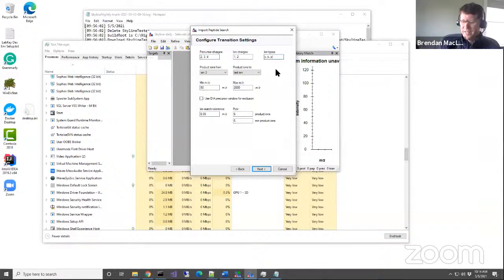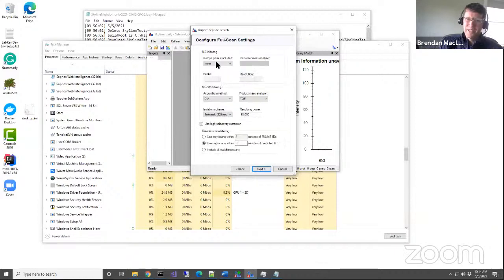See, it added a P there because if you're doing MS1 filtering, it needs a P, but it clearly doesn't remove the P when I turn it off again. Anyway, this is now what you want to have on this page. MS1 filtering is definitely interesting, but an advanced topic that we're not going to treat here.